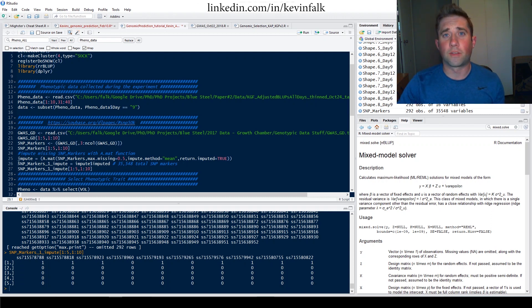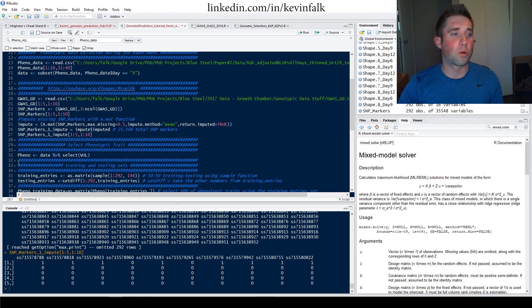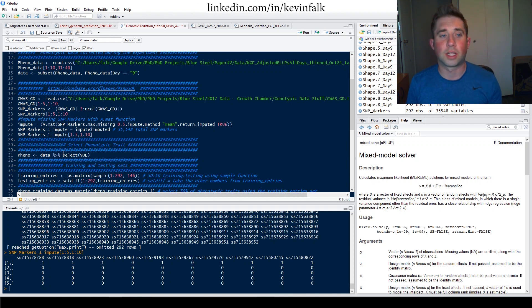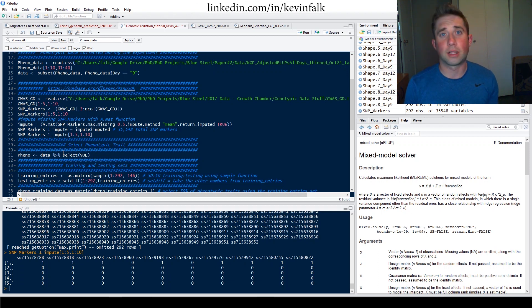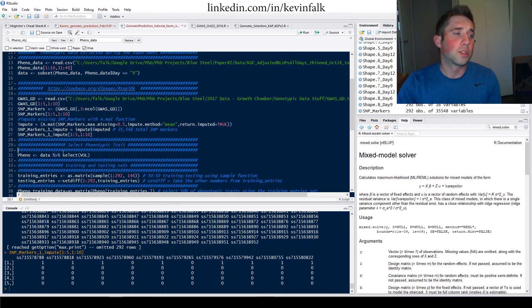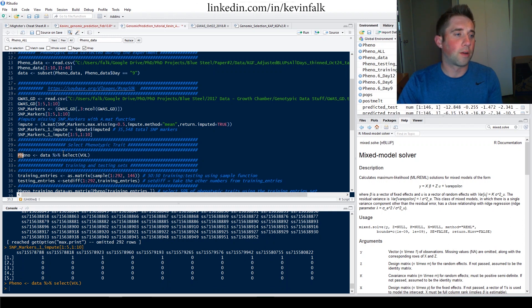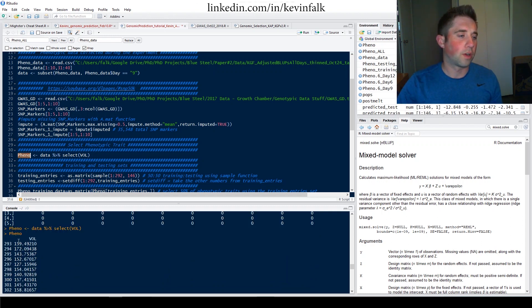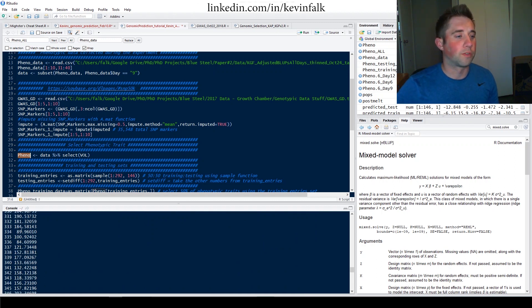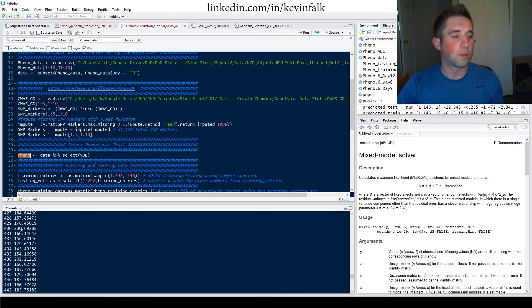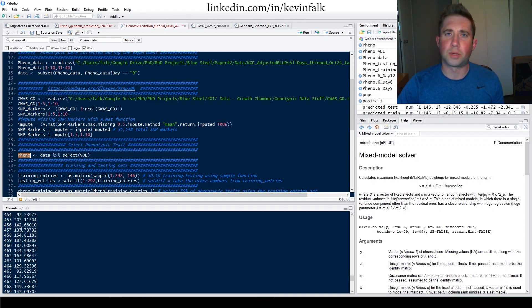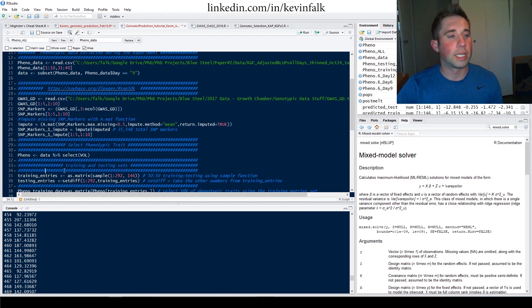Now we need to get our phenotypic data ready, and that's pretty straightforward. Our data is listed as 'data', and I'm going to use a pipe and the select function from dplyr to select one particular phenotypic trait collected during my experiment. For this it's root volume — the primary root volume. I'm going to set that as 'pheno'. Looking at it now, we have about 300 observations of root volume in centimeters cubed. Now that we have our phenotypic data and already have our genotypic data, we're ready to take the next step.